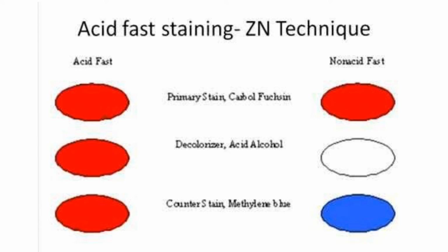In this figure, you can clearly see the difference, how acid-fast and non-acid-fast are stained differently. At first, both of them are stained by Carbolfuchsin. All appear to be reddish in color. Then, after applying the strong acid alcohol solution, which is a decolorizer, meaning that it will remove the stain, the acid-fast organisms retain their red color, whereas the non-acid-fast become colorless. Then the non-acid-fast are counterstained with methylene blue and appear blue in color, whereas the acid-fast still remain red.